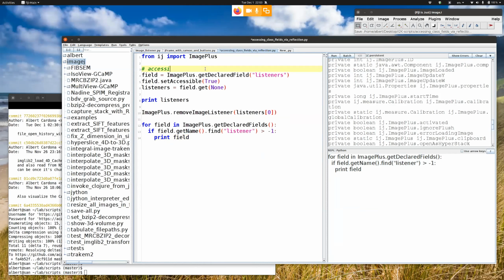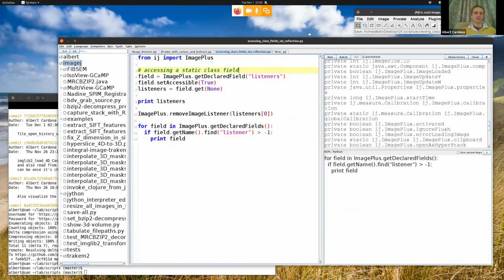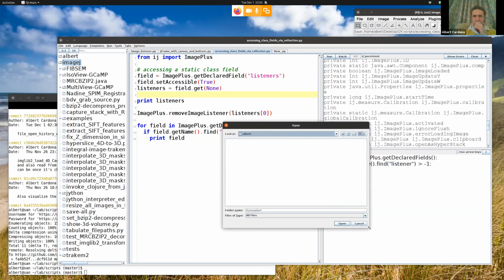Yeah, and then if you can share them in Slack, because I expect everyone's in the Slack channel that was shared via email, that could be good. Yeah, I can also send an email to all of you with all of these scripts. That's a fair point. So actually, something I can do as well is I can select. Where is it? Huh? Why doesn't it show anything?